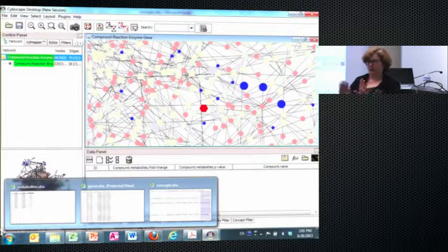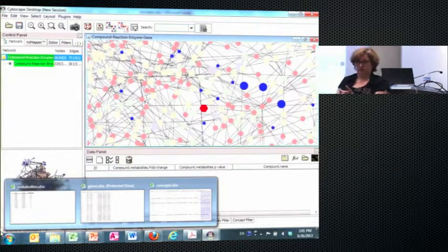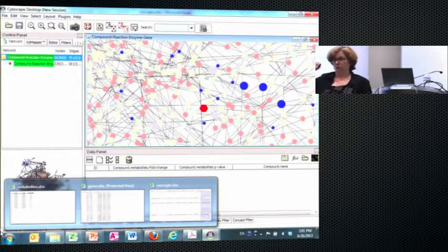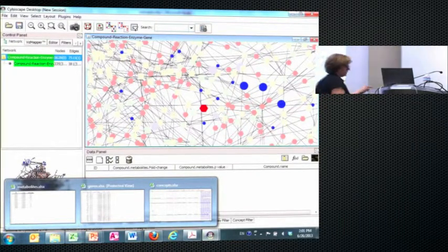If you have already compared these two groups, you may already have fold change or log fold change and some kind of significance value, like a p-value. That is the simplest case, where you just put that in, and that would be your input file, just like I showed here.